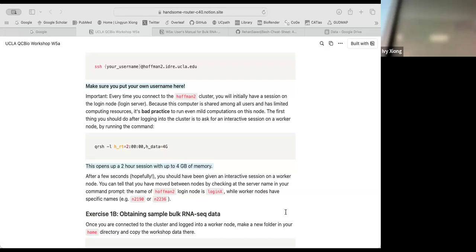This makes sense. I have it. I'm looking at it. And then if I don't use it, I don't know what it is. It's allergy, so we're getting copy pastes. And those are probably going in. Or not.